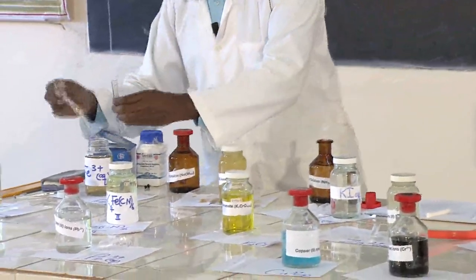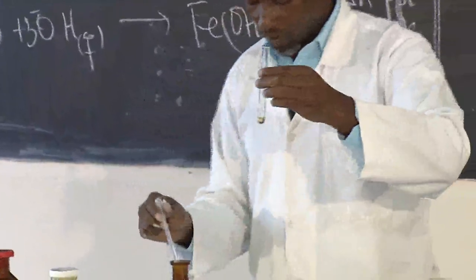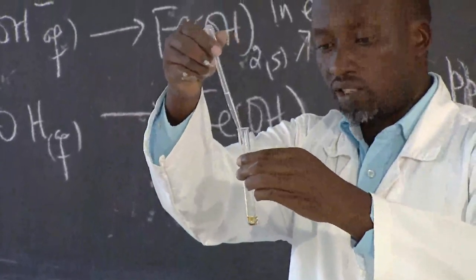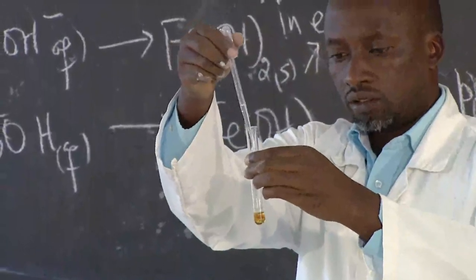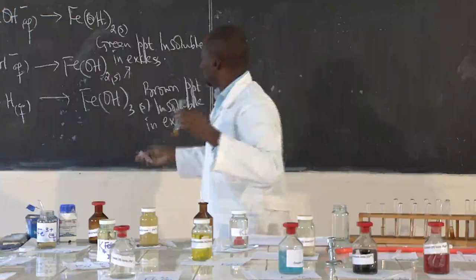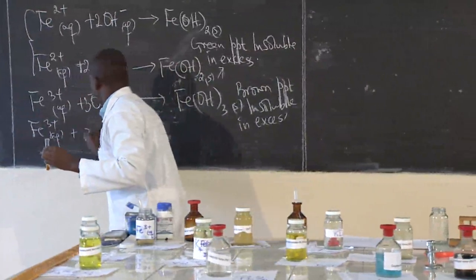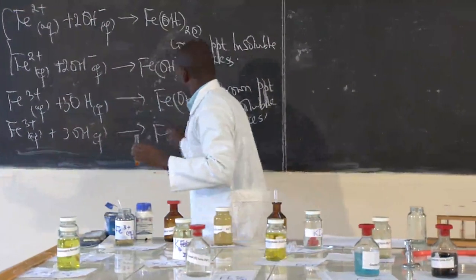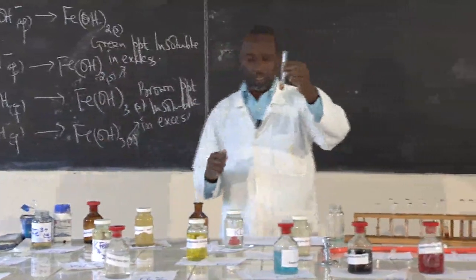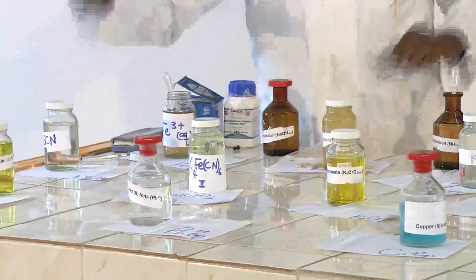Now we look at the effect with ammonia solution on iron 3. We start with iron 3, add some few drops, then add some few drops of ammonia solution drop-wise. That gives the same precipitate — still we are having iron 3 reacting with the hydroxide ions, giving iron 3 hydroxide as a solid precipitate as well.